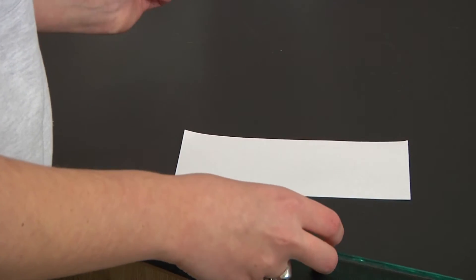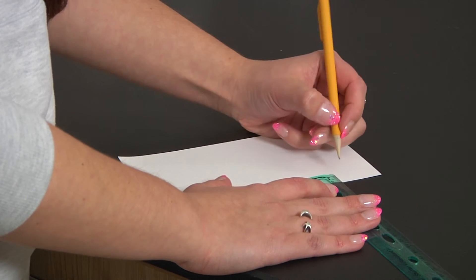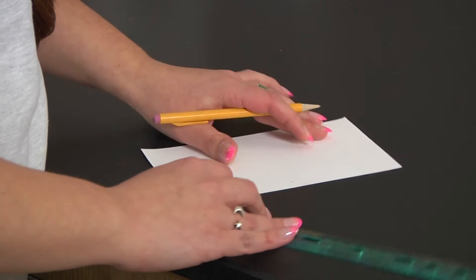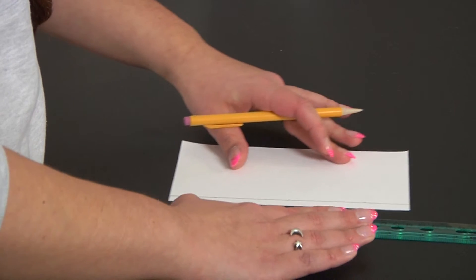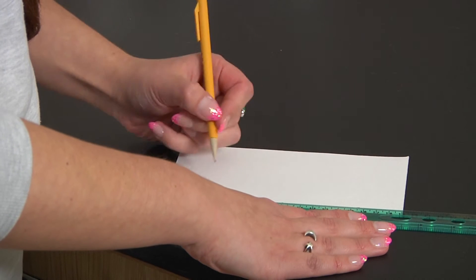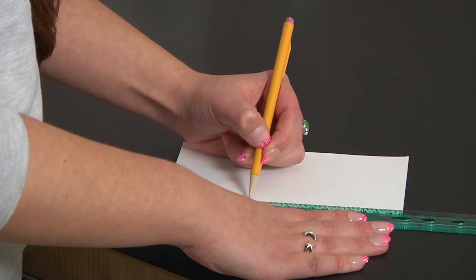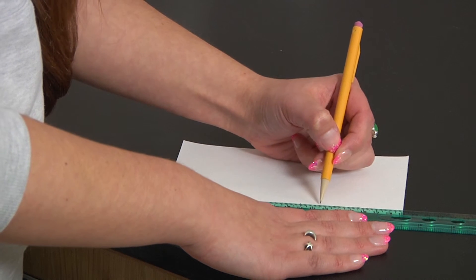The first thing you're going to do when you get your chromatography paper is make a line one centimeter up from the bottom of the sheet, all the way across. Once you have that done, measure in from the left corner about three centimeters and then make a mark every two centimeters, all the way across.